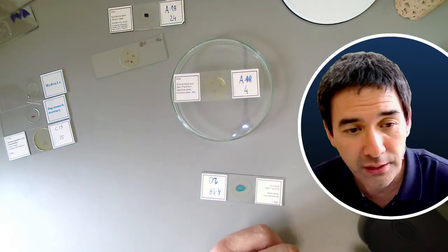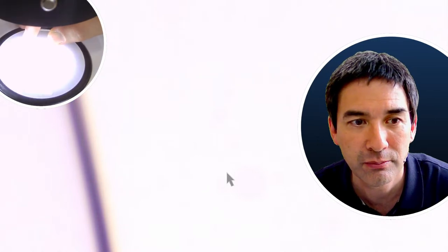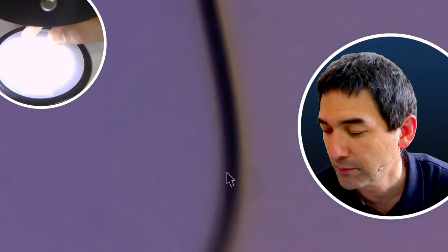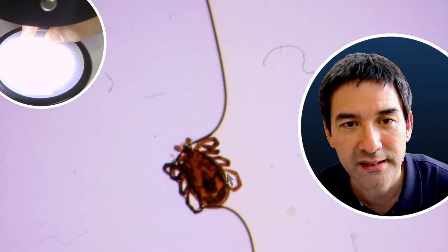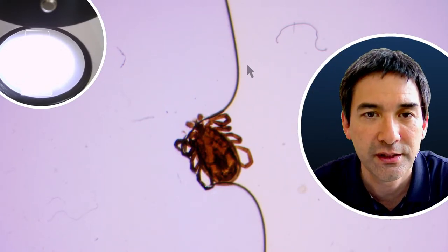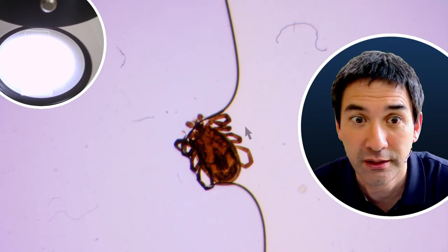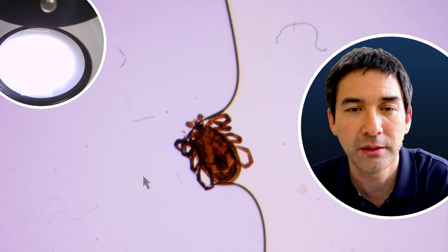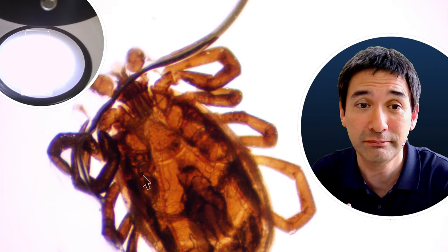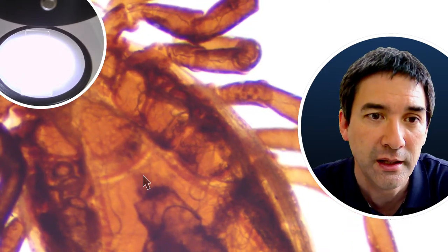This here is a tick — not so nicely mounted, I have to tell you. I occasionally get bitten by ticks, especially during summertime. Let me deactivate and activate the camera again. This is an example of a badly mounted specimen slide — you can see the mounting medium here and there's air where there's no mounting medium. A couple of years ago I got bitten by this tick and carefully pulled it out. Not a good idea to be bitten by ticks because they do carry diseases. The exoskeleton is relatively transparent — I think this must also be Euprol — and I'm surprised by the image quality the stereo microscope is able to produce.